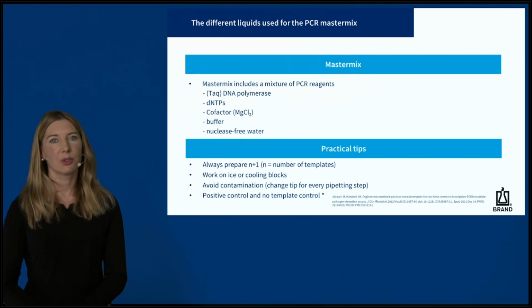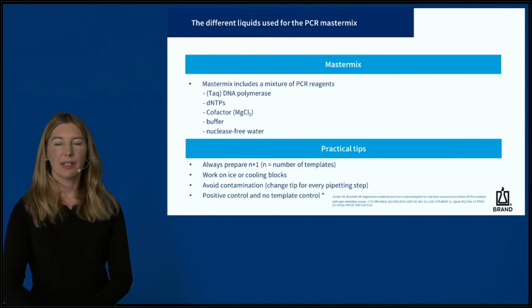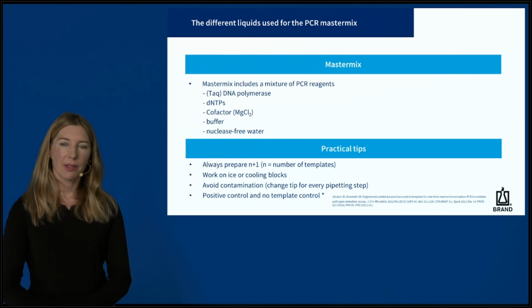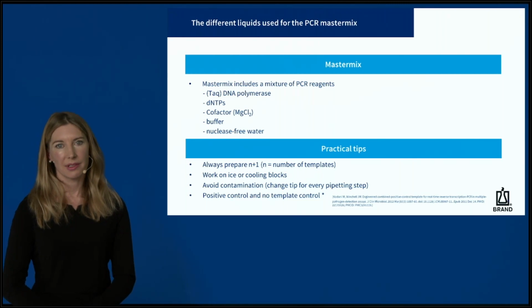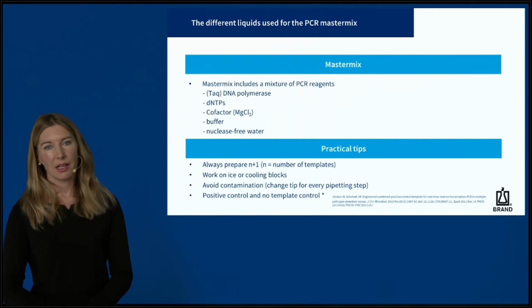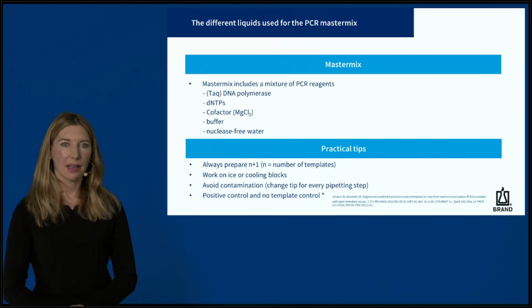It is important to prepare a bit more than the required volume. This ensures to have enough volume, even in the case of pipetting inaccuracies. Sample loss may occur because enzyme solutions like the master mix contain detergents. Detergents are likely to foam, which might lead to inaccuracies during pipetting. On the next slides, we take a closer look at how we achieve more accurate results when pipetting buffers or viscous liquids like the Taq polymerase.